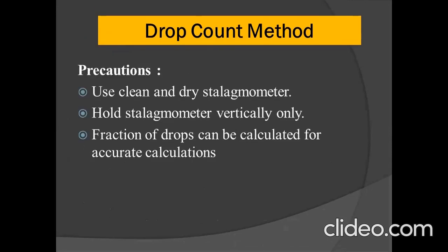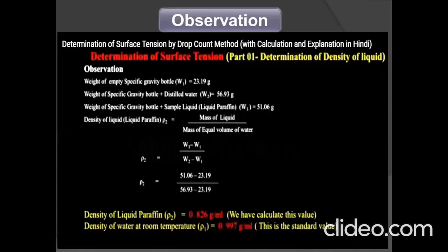There are some precautions you should take for this method: use a clean and dry stalagmometer, hold the stalagmometer vertically only, and fractions of the drops can be calculated for accurate calculation. Now the next part is the observation.